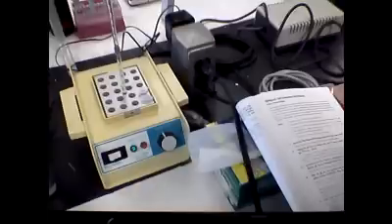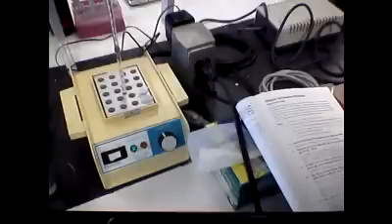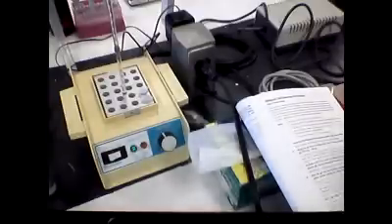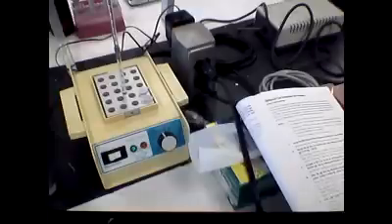And usually your solution will melt down pretty well during that time. If you still see lumps, you may have to leave it in for a little while longer. The agarose has to actually break down to where you can run your solution through the spin columns. Once the 10 minutes is completed and you have vortexed and mixed the DNA, you're going to have to place your DNA into one of these.